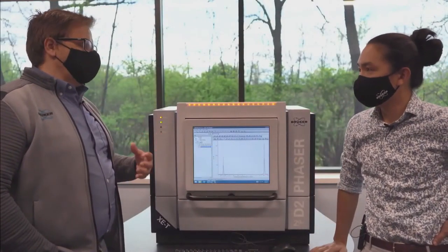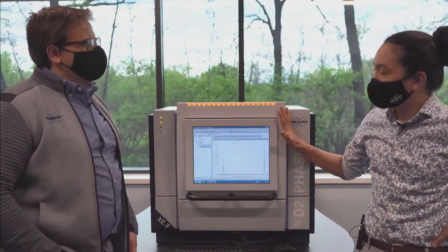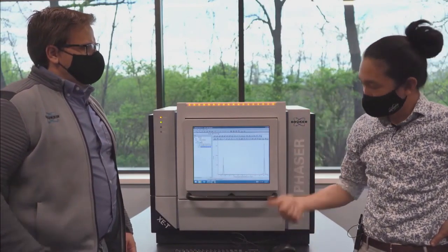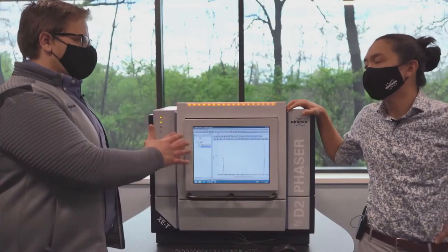So is this some sort of algorithm that we're applying to the data? No, this is actually the data that you're collecting. This is raw data. We are just intentionally saying, I only want copper K-alpha X-rays, not copper K-beta. So using those innovations about the charge sharing, eliminating that, we're able to effectively get this kind of threshold.